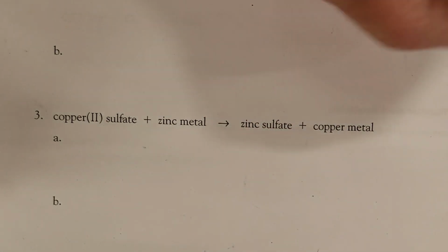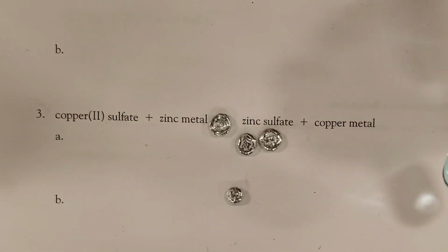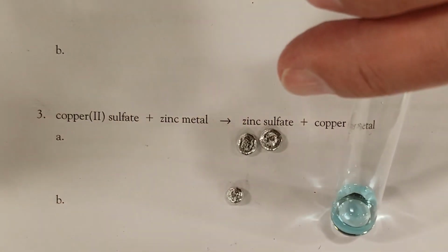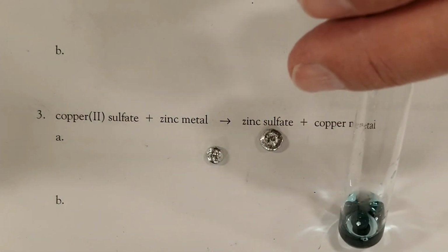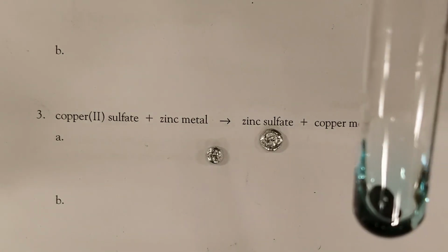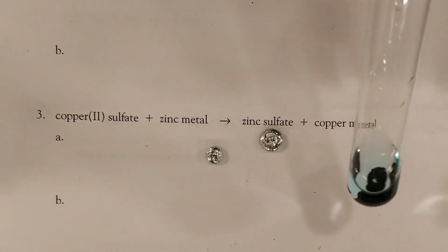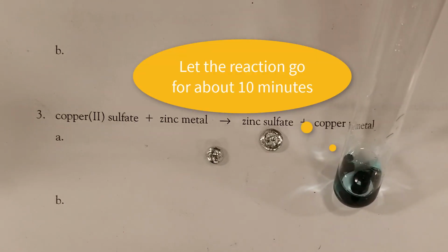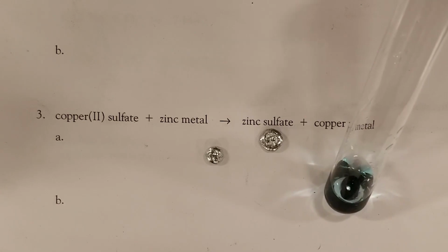We'll add in a couple of nice shiny pieces of zinc metal. We'll add a couple of those in there. And pretty quickly you should be able to see that the nice shiny zinc is turning all black. And we'll let that sit and react for about 5 or 10 minutes and then take another look at it.